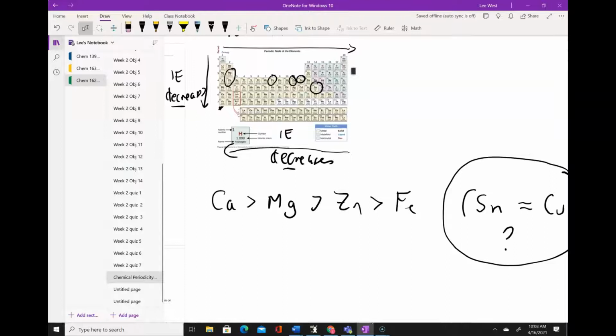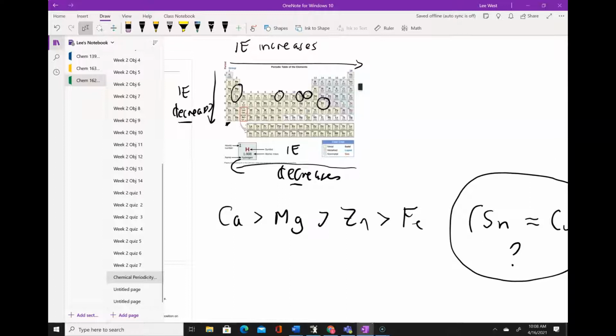is it consistent with what I was saying before from the water, that as we move down and to the left, reactivity increases? And it is, with really one exception, that the zinc here is unusually reactive, isn't it? Right, unusually reactive, which is somewhat surprising. So that general trend of increasing reactivity towards the bottom left corner of the periodic table is correct, but the tin is kind of bucking the trend.